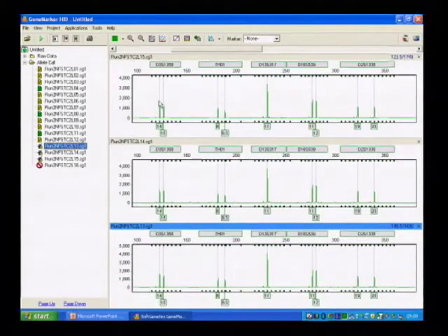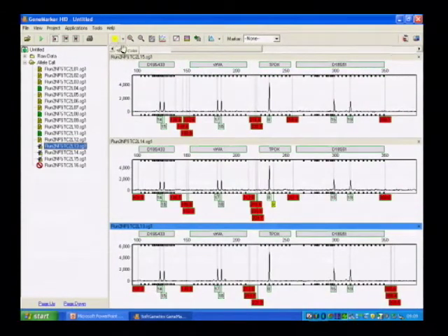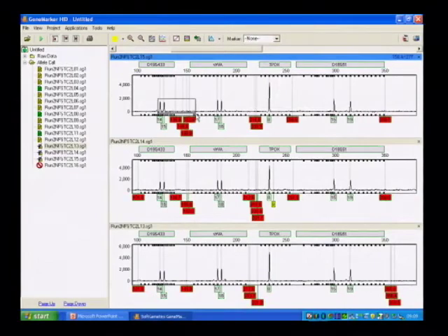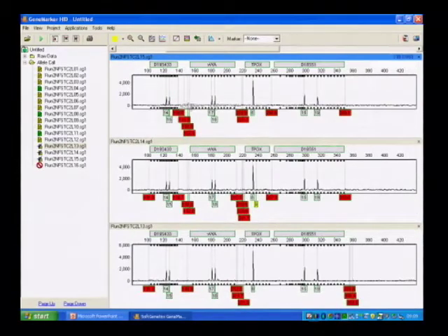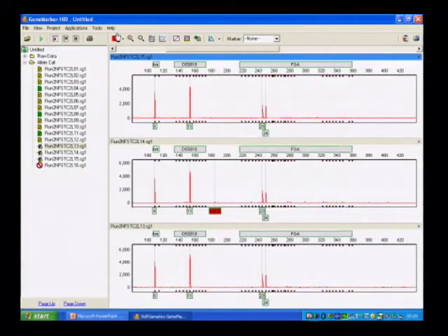In the green traces, also around 1500 RFUs on average. The yellow trace, which is a little bit noisier down here, appears to be called by the software. These little bumps on the baseline, which are above the calling threshold, get identified, but they're clearly not peaks. This is the red trace.